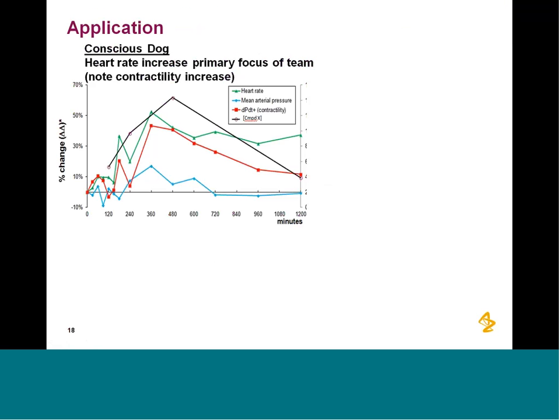This is from a project, again, that I can't name, but the project had seen that heart rate in green is going up. So this is from conscious dog data, and heart rate is going up here.